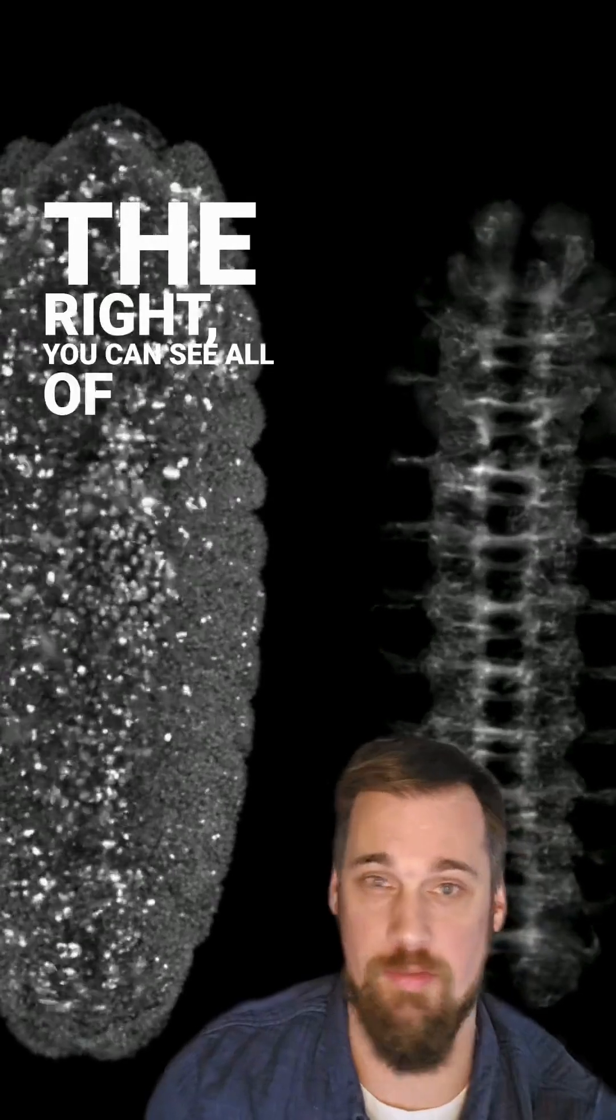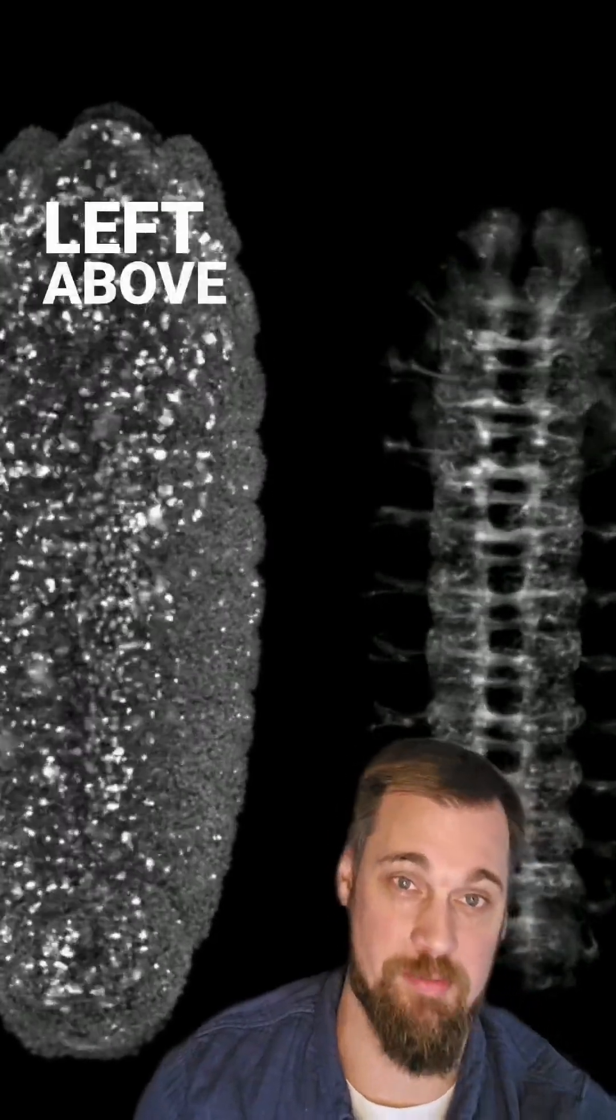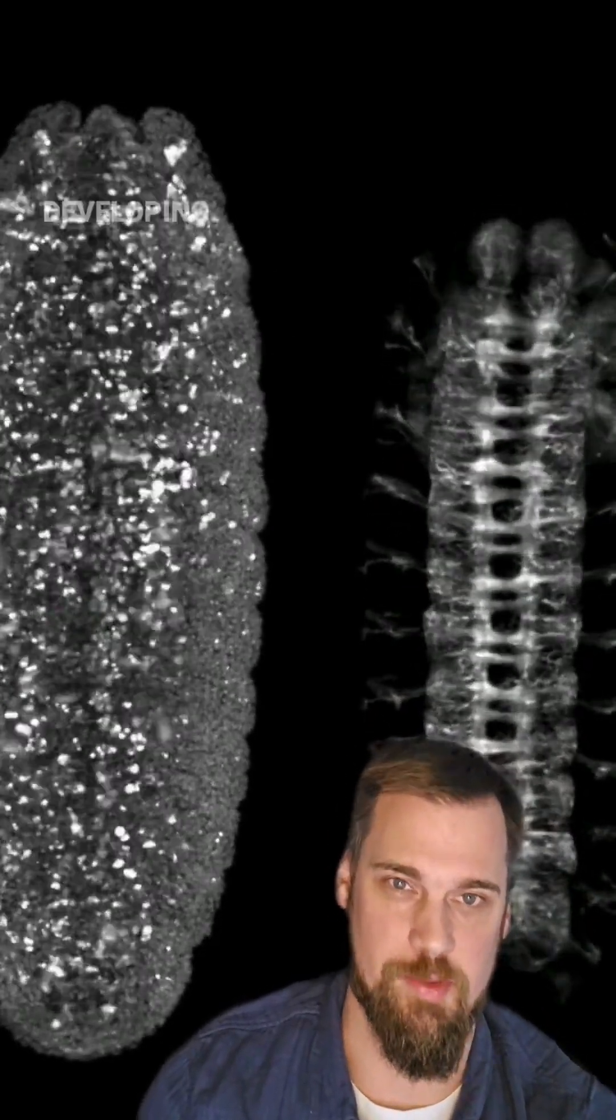So on the right, you can see all of the cells in the embryo. And on the left, above my head, you can see just the nervous system developing.